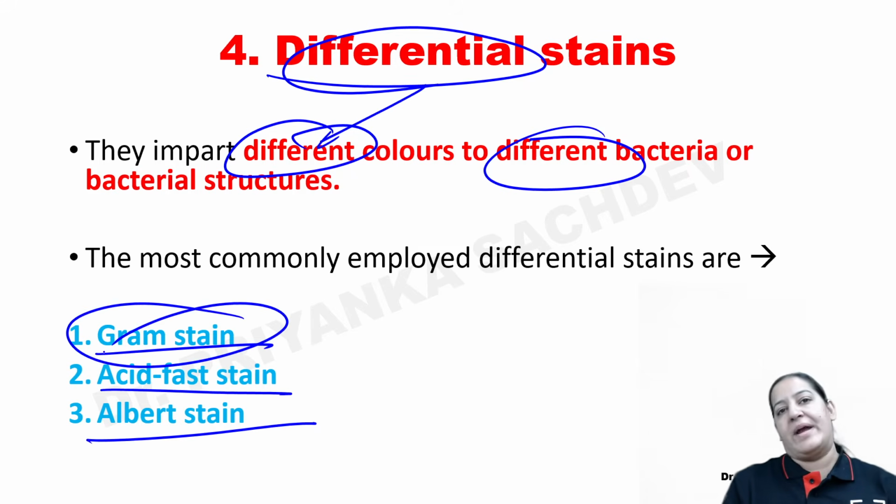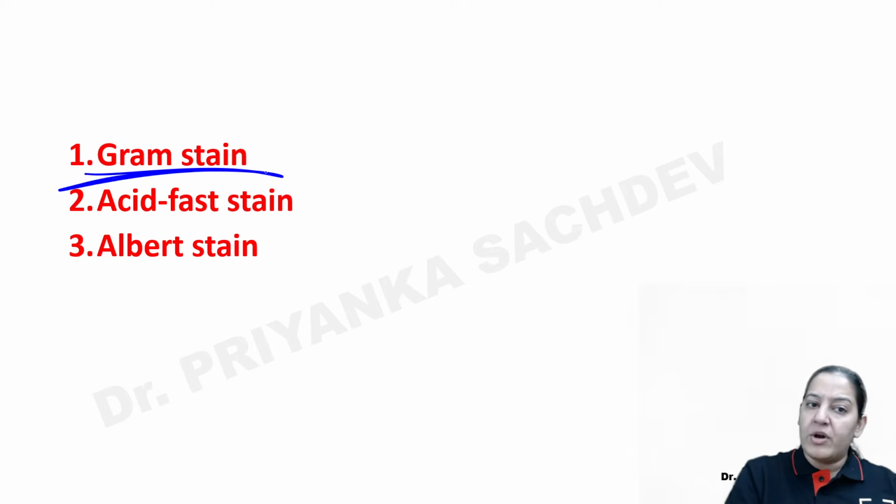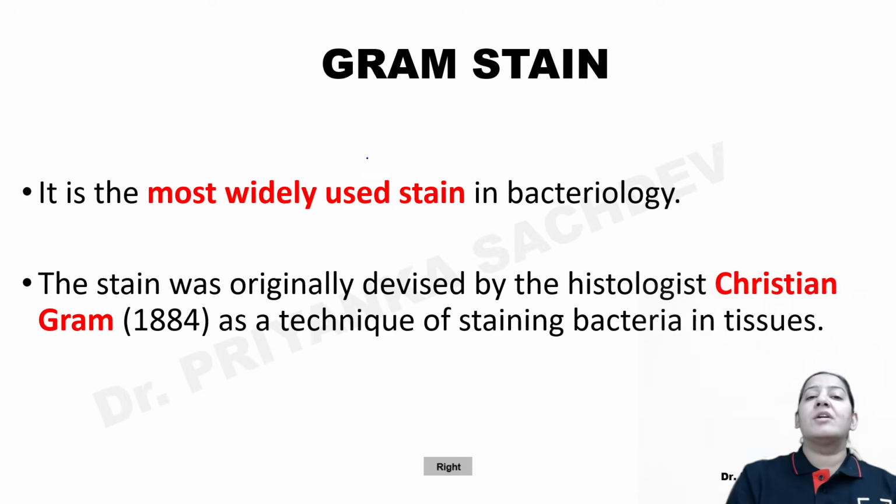So I'm starting Gram stain right now. In this session, I will be teaching you Gram stain in detail. Right? So let me start the Gram stain.